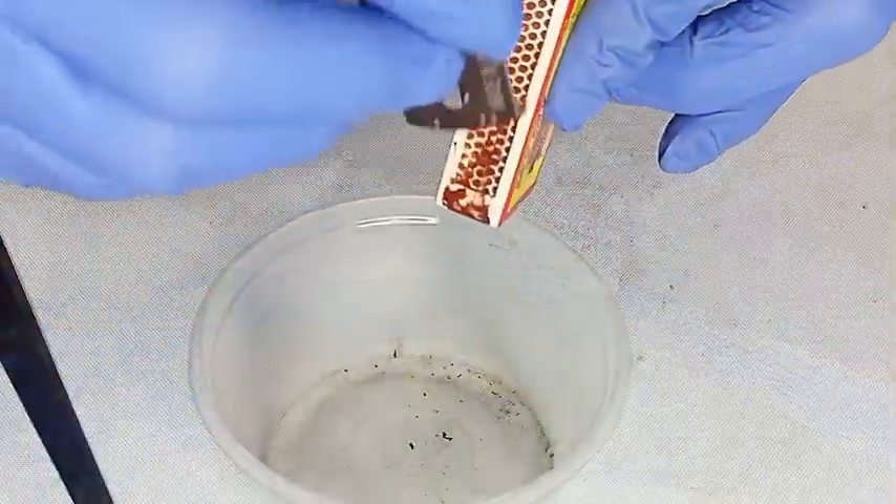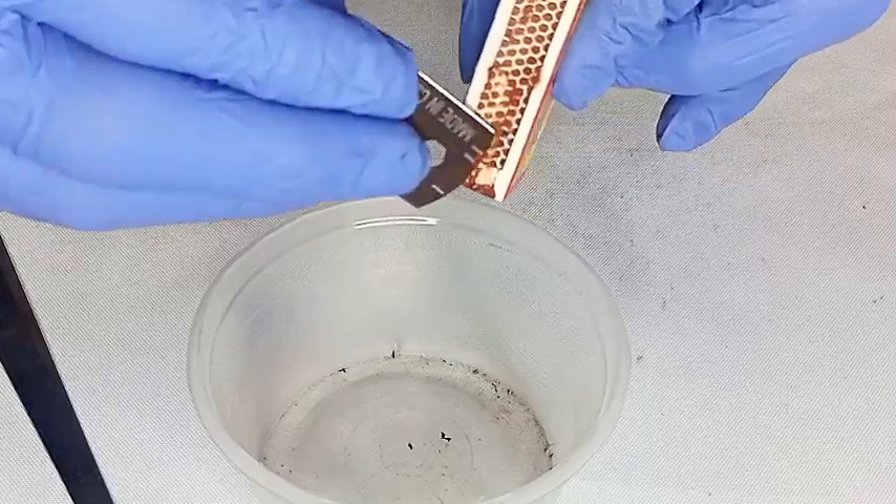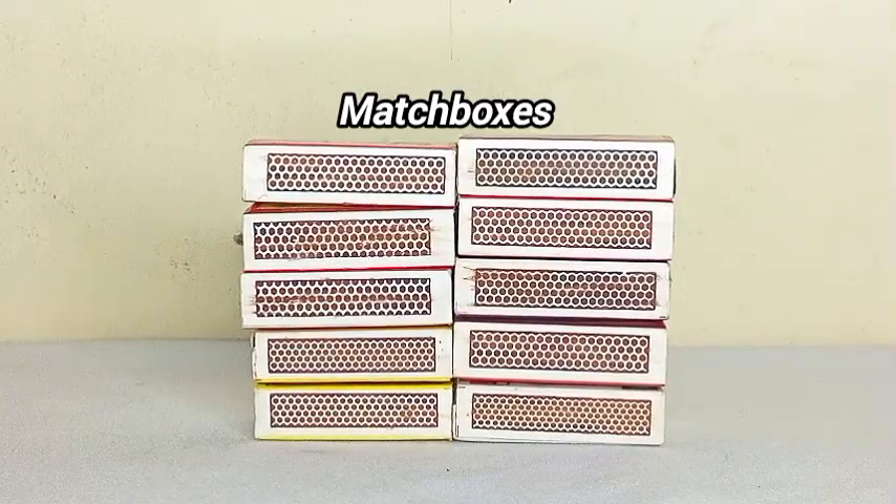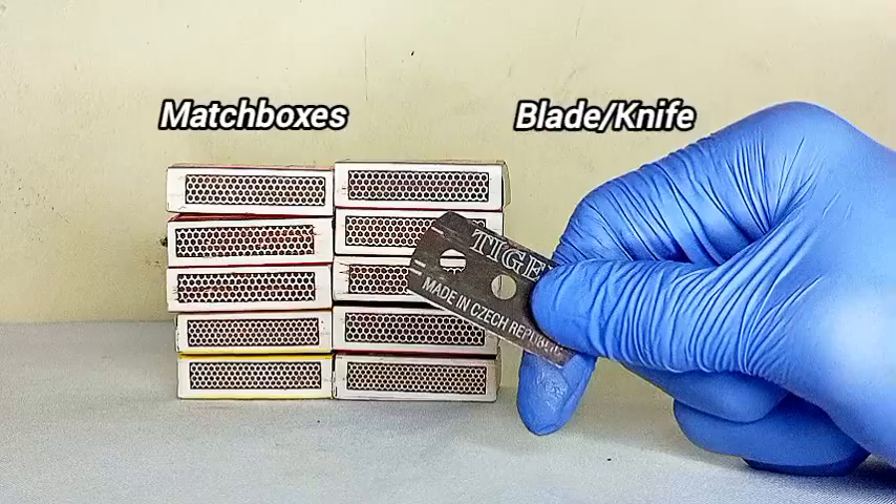So in this video, we are extracting red phosphorus from matchboxes. The materials we need for this experiment are matchboxes and a blade or a knife to scrape off the phosphorus.